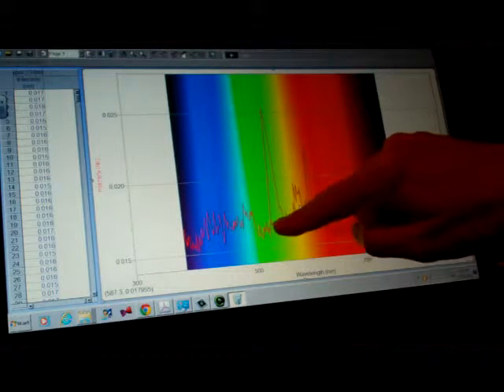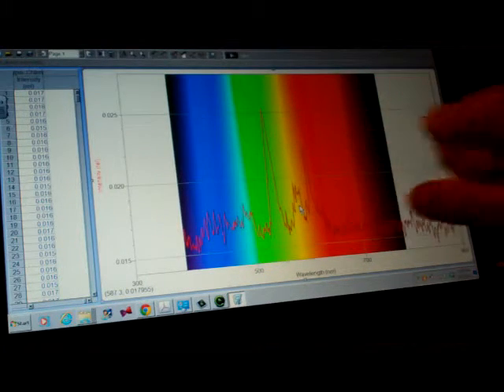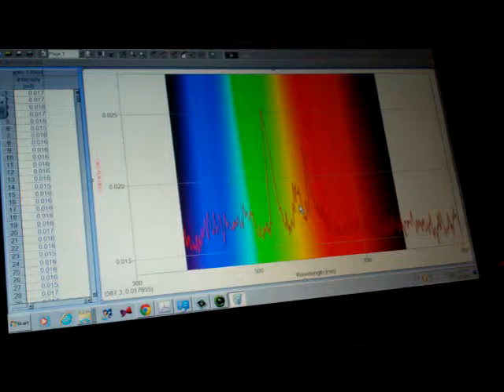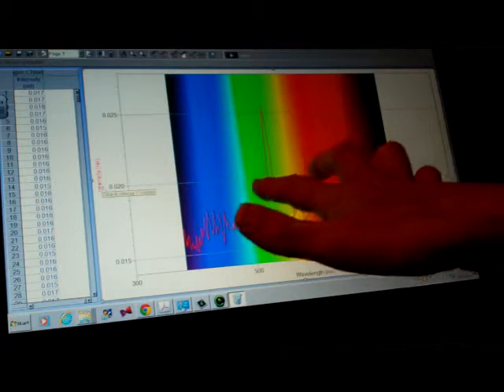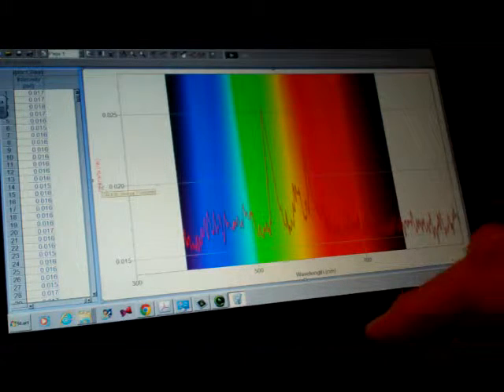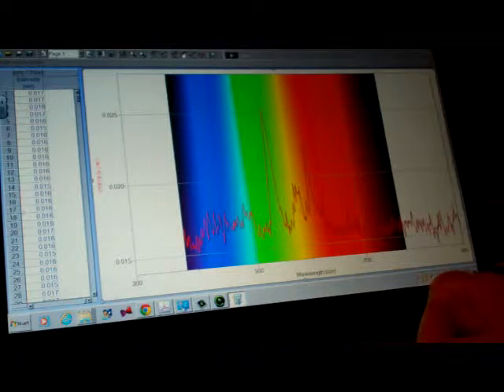And that's perfect, because then I can examine for our lithium. Actually, there were a couple peaks there. I can examine just what wavelength does that absorb at. And that's the data that's relevant to the lab. You need to remember these numbers, record them, and what they wanted to know is the wavelength of max absorption.